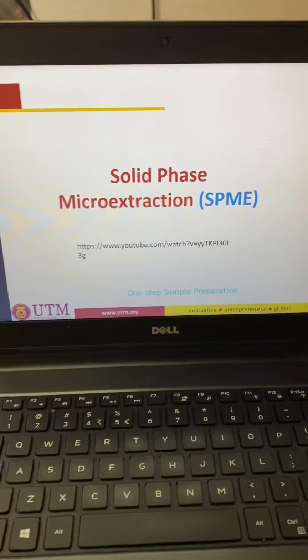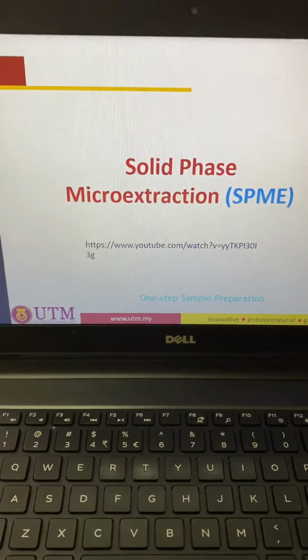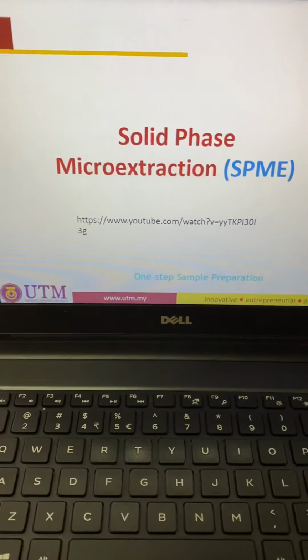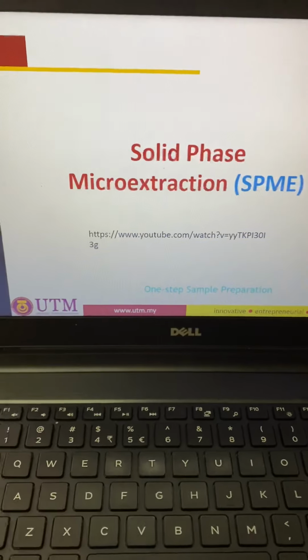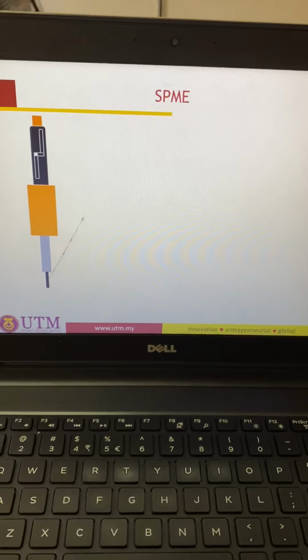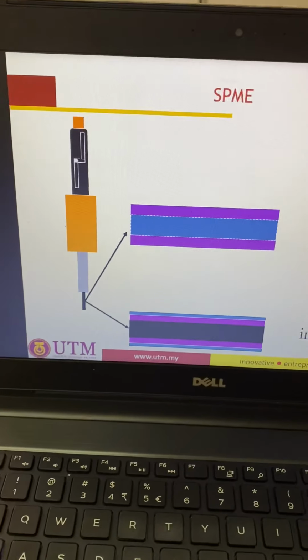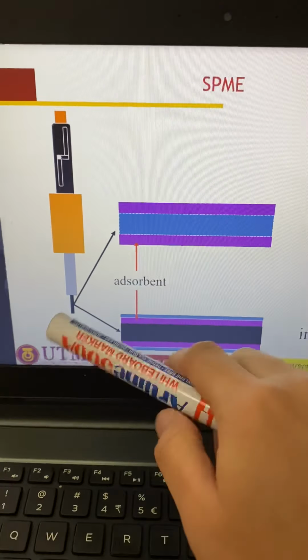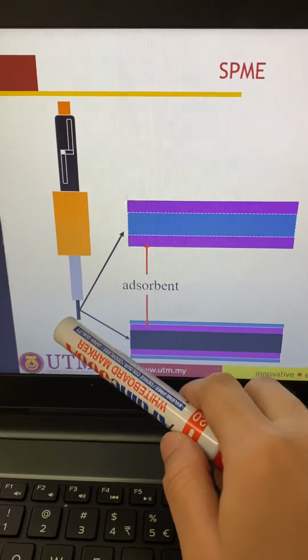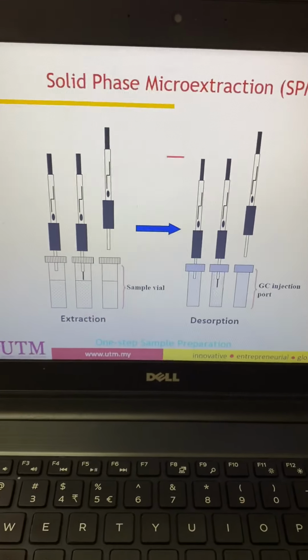Our first online class. From the previous class, I touched on solid phase microextraction. We saw the videos and everything, and we already know that it requires something like a pen, whereby inside the pen we will have an adsorbent which is coated with a polymeric supporting material.